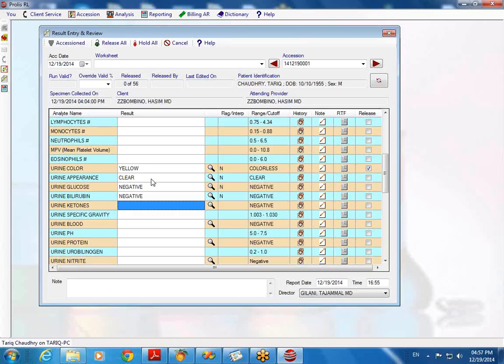For example, one of our clients in Nevada runs LCMS, a confirmatory toxicology. The output of the analyzer they are using is in the form of a spreadsheet. We have provided them the interface, and right now the interface is running and putting the results automatically in place.